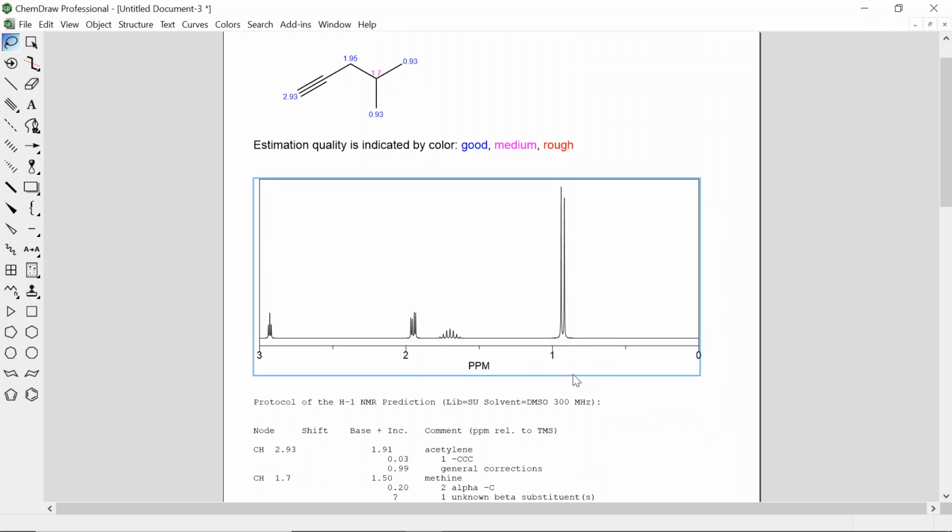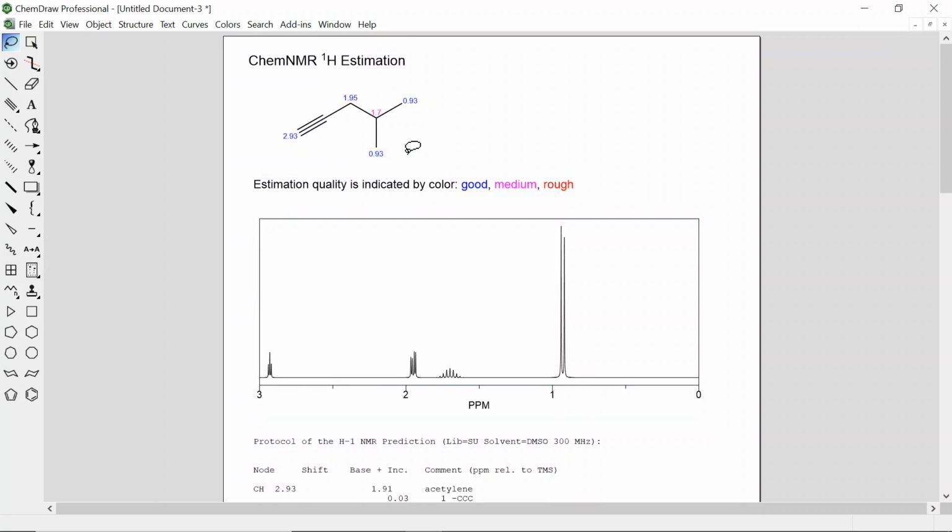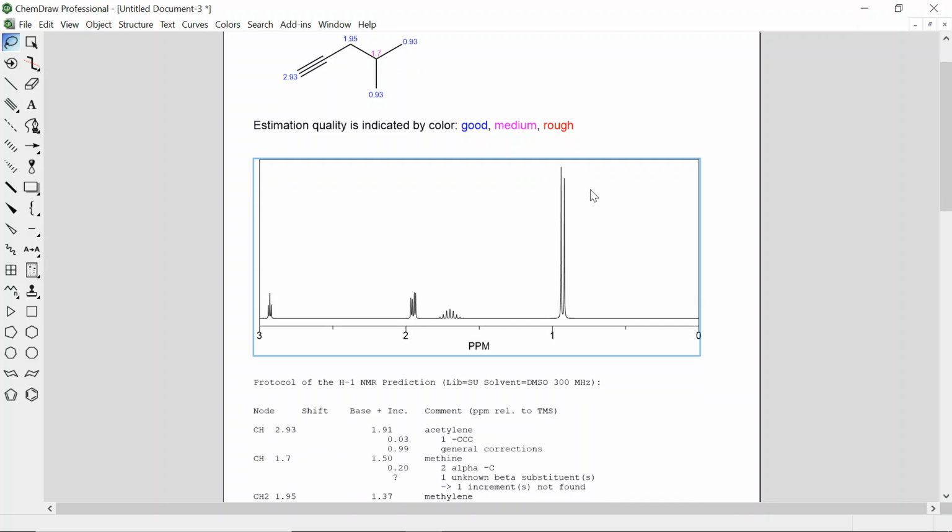Okay, notice that here you're given 4 different chemical shifts. It even tells you which ones it knows are pretty accurate and which ones it's maybe not so locked in at the exact number. Okay, and it shows you the splitting patterns that we are expecting for these 6 hydrogen signal right here. It is indeed a nice little doublet there. For this 1 hydrogen, you've got much more going on there because it's split by these as well as by these. Okay. All right.